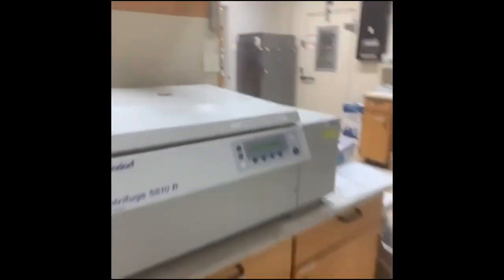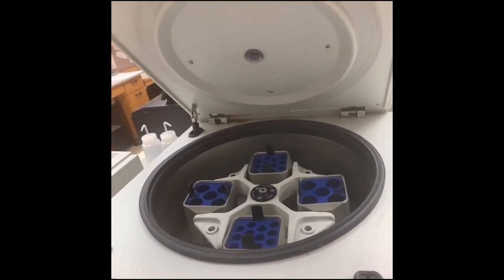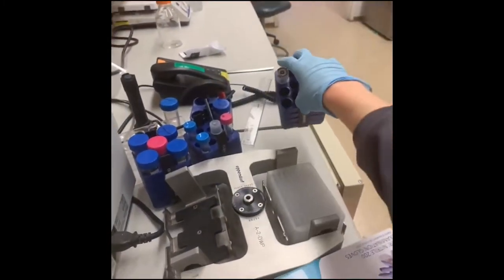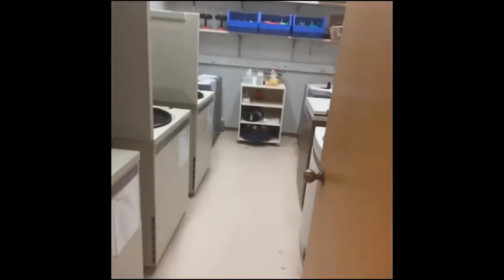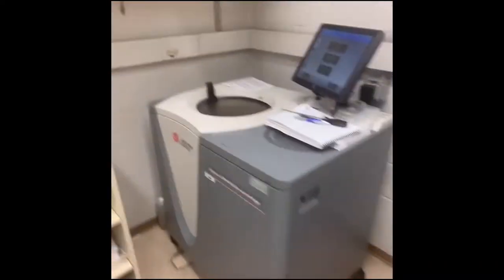This is a benchtop centrifuge — really good for spinning down mini preps and protein concentrating. It's a swinging bucket style with different adapters for different sizes of tubes or plates. Then we have even bigger centrifuges in our centrifuge room, which we use when spinning down liters of cell culture — more swinging buckets there. We also have ultracentrifuges which go super super super fast. Those are really good for when you've broken open cells and want to separate the soluble stuff from the membrane material. These use fixed angle rotors, where the tubes are held in a fixed position, unlike the swinging bucket.